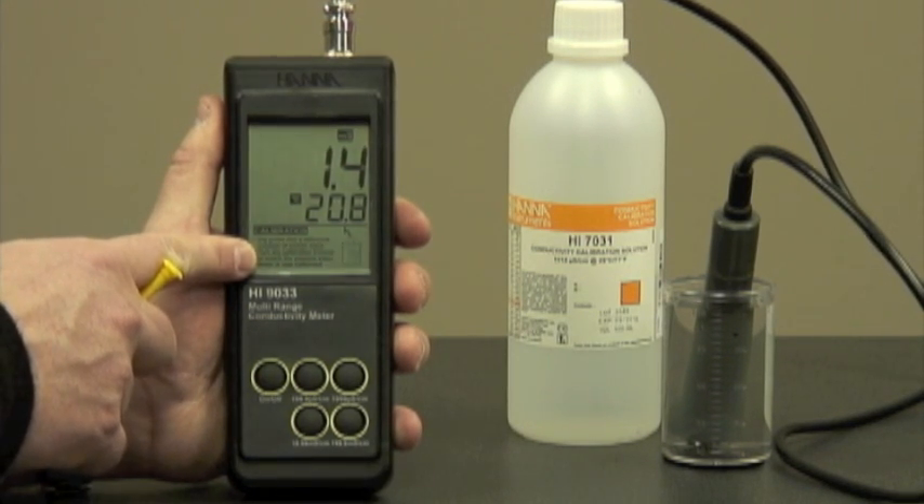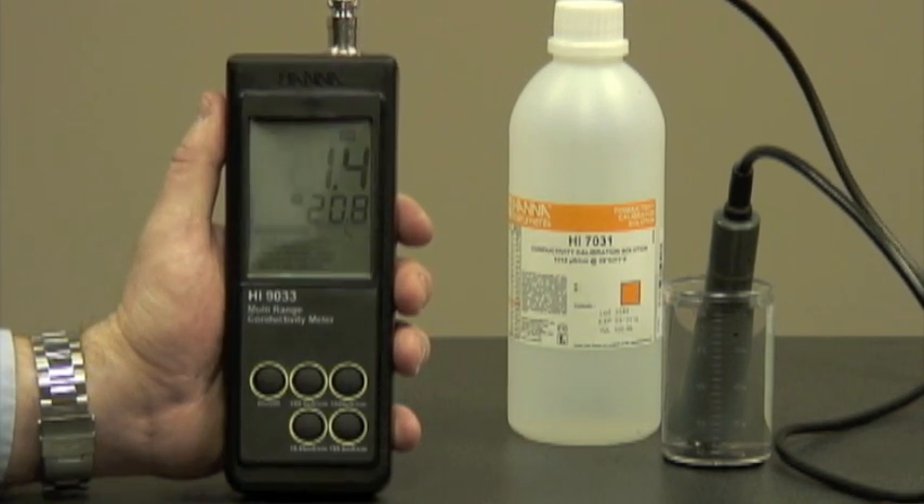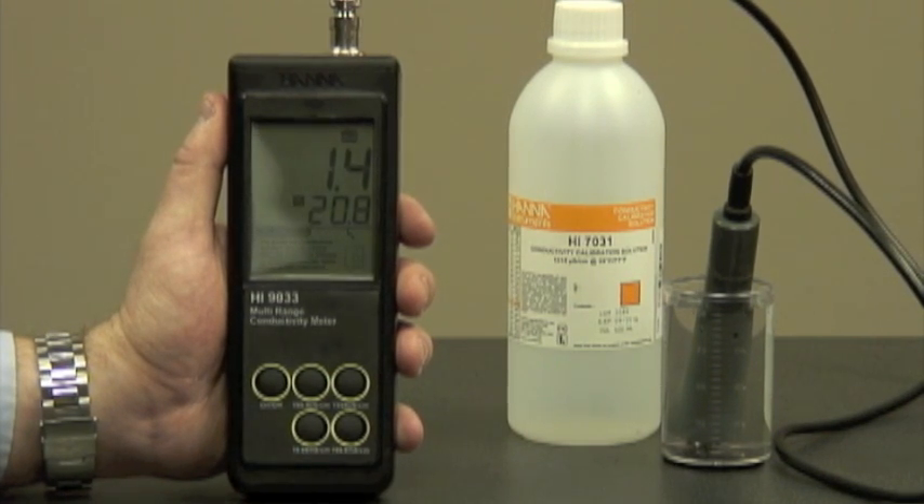We're going to be using the HI7031 conductivity calibration solution at 1413 microsiemens. This comes in a variety of sizes, from sachets to one-gallon bottles, and standards are available ranging from 84 microsiemens to 111.8 millisiemens.